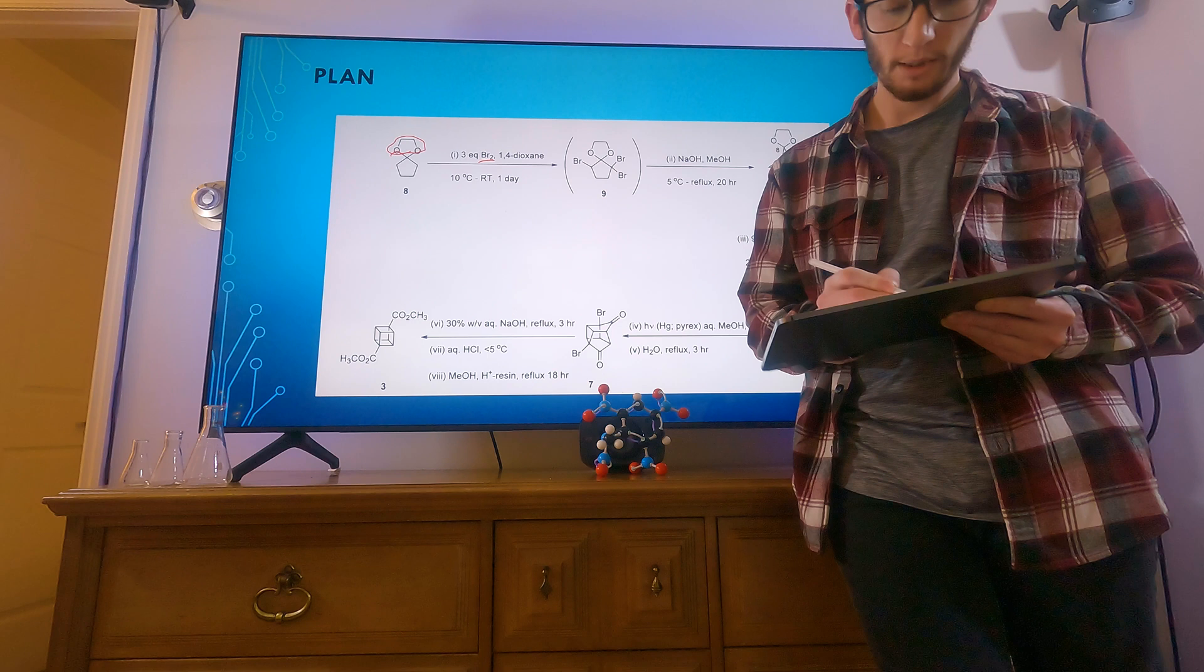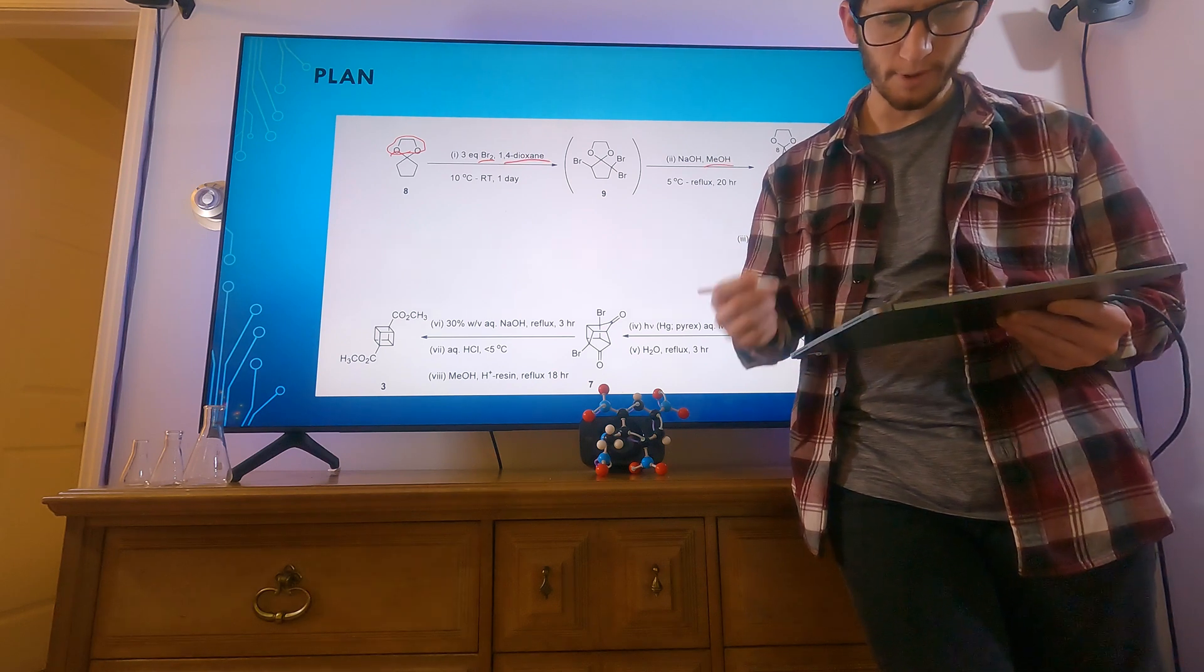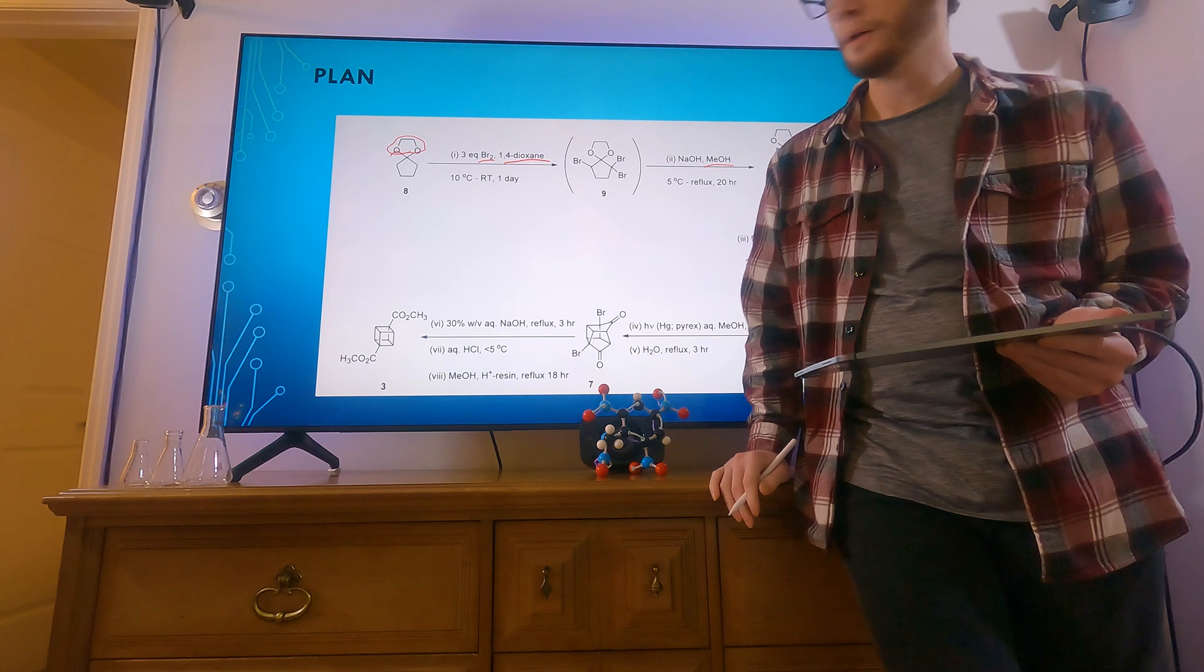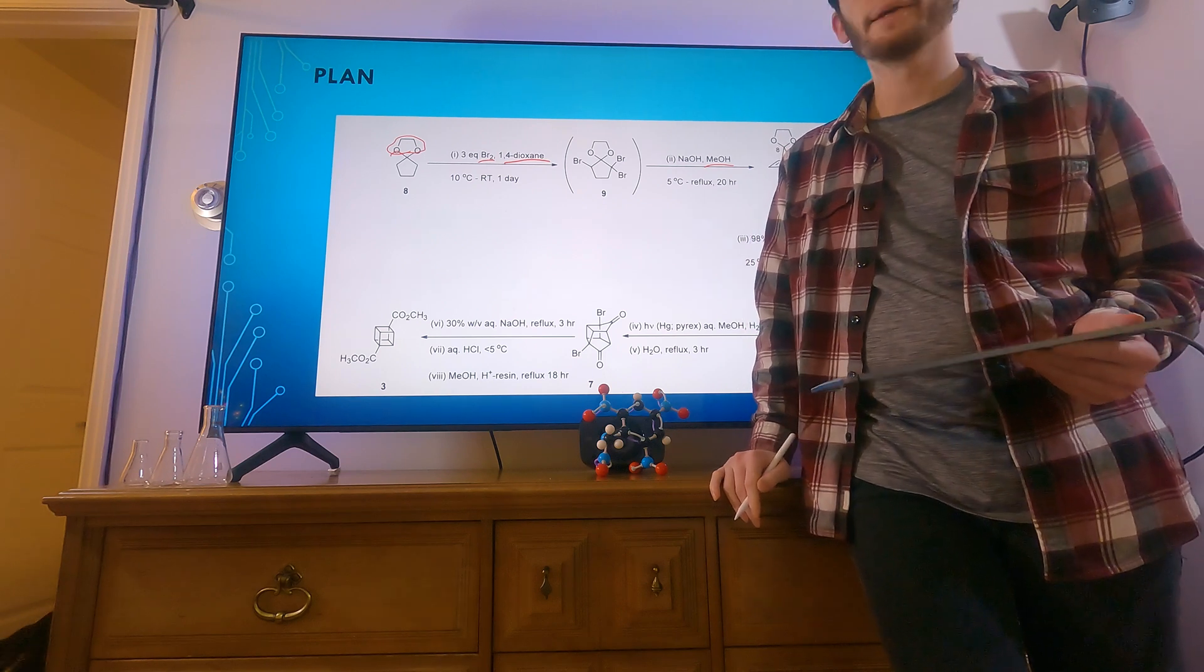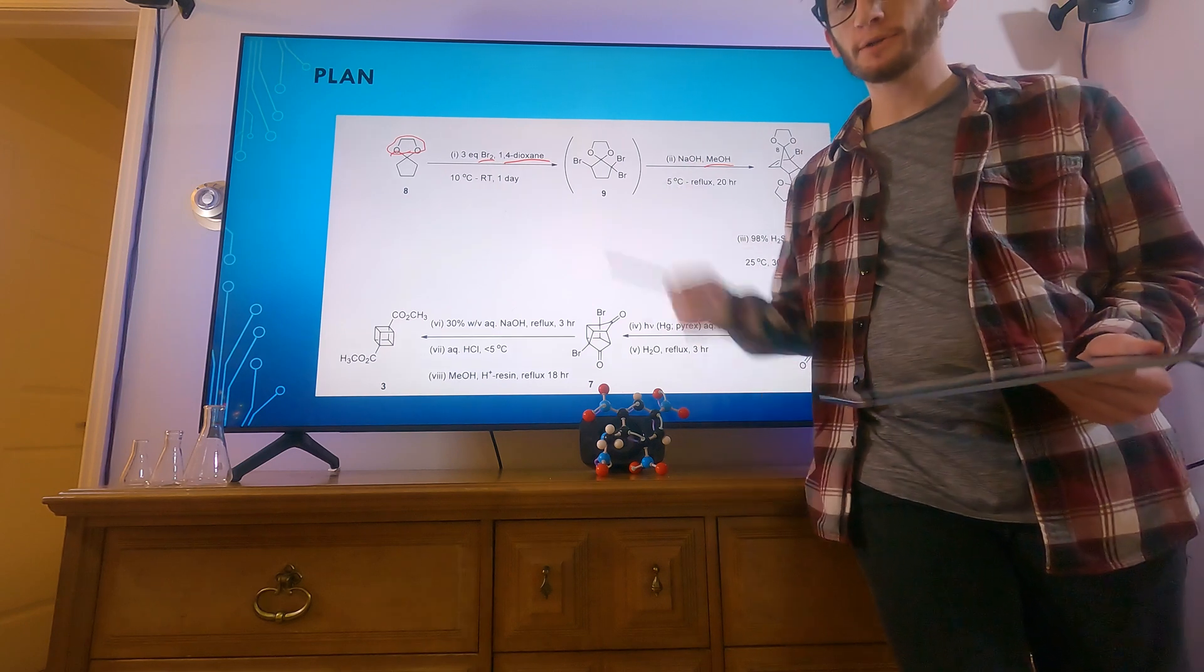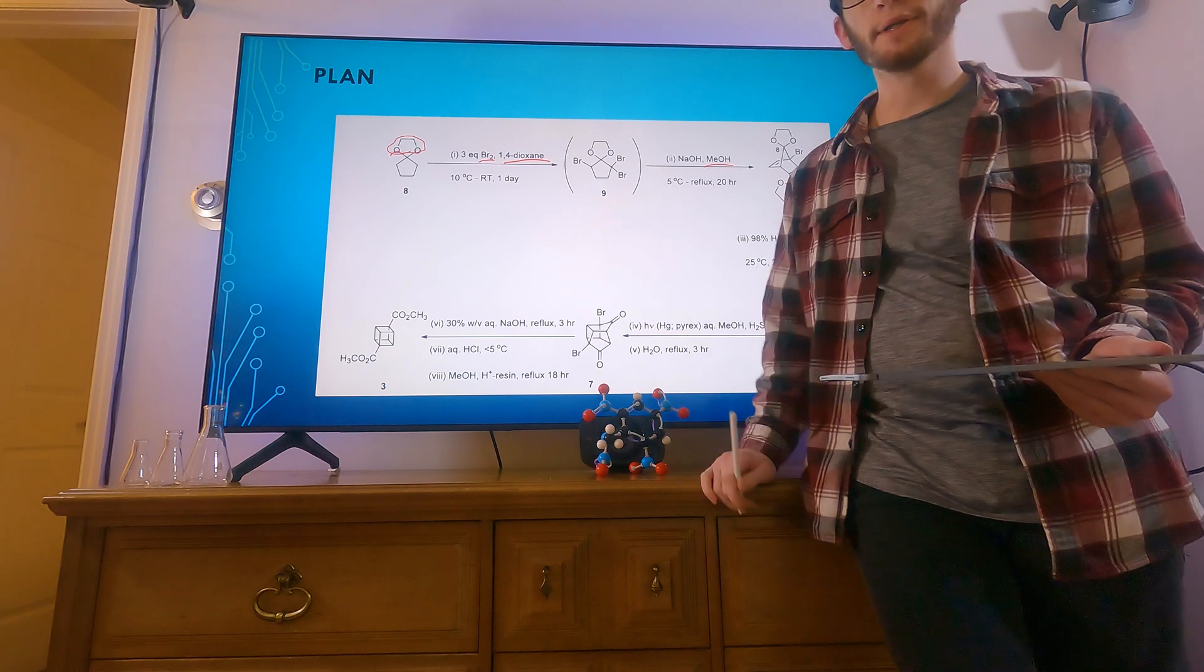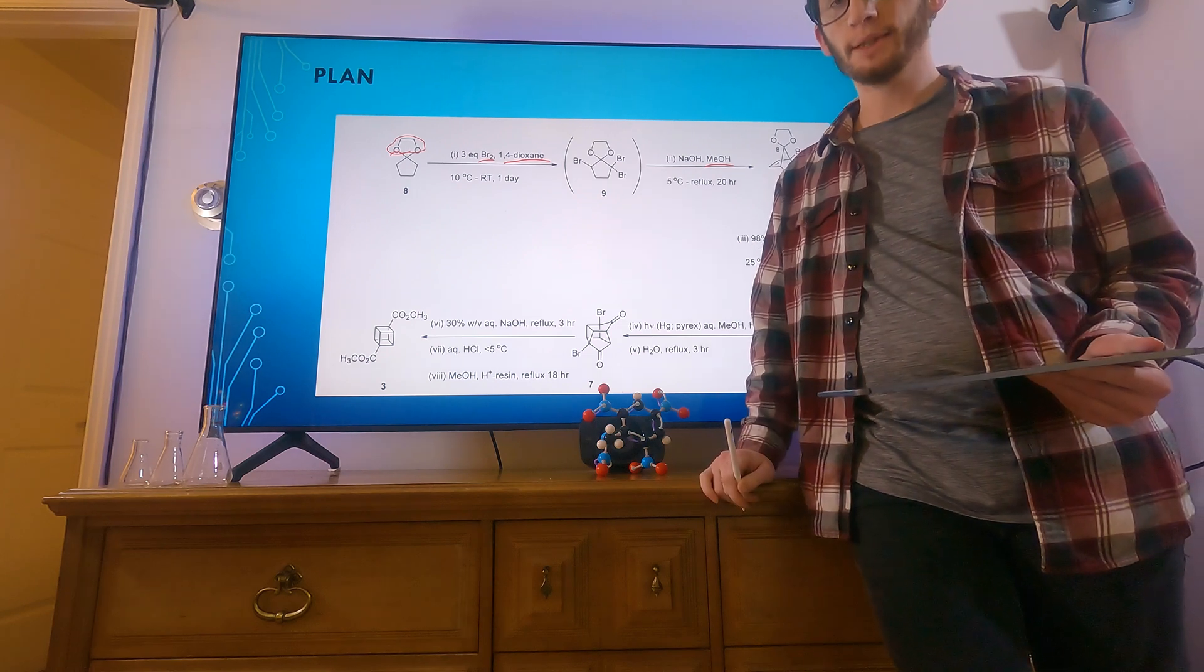We're going to need to make the bromine, the dioxane, the methanol, there's a few other things here. And we'll show the drying and everything there and all of that that goes into everything. Because we need to do most of this in a really dry environment, so our reagents are going to need to be really dry.